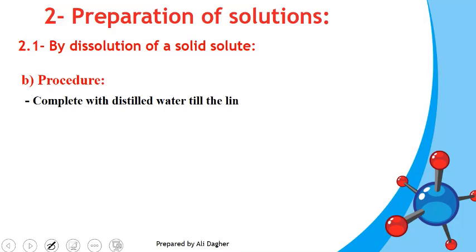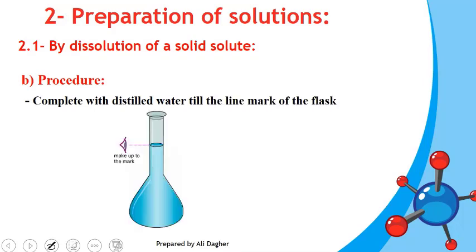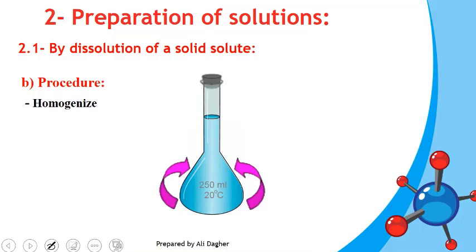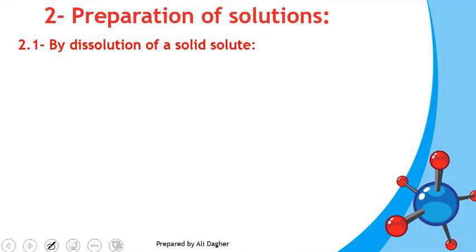Then we complete with distilled water up to the line mark of the flask. Our eyes should be at the same level as the line mark to read the volume correctly — the meniscus should be tangent to the line mark. Finally, we stopper the flask and shake to make the solution homogeneous. This completes the procedure for preparing a solution from a solid solute.